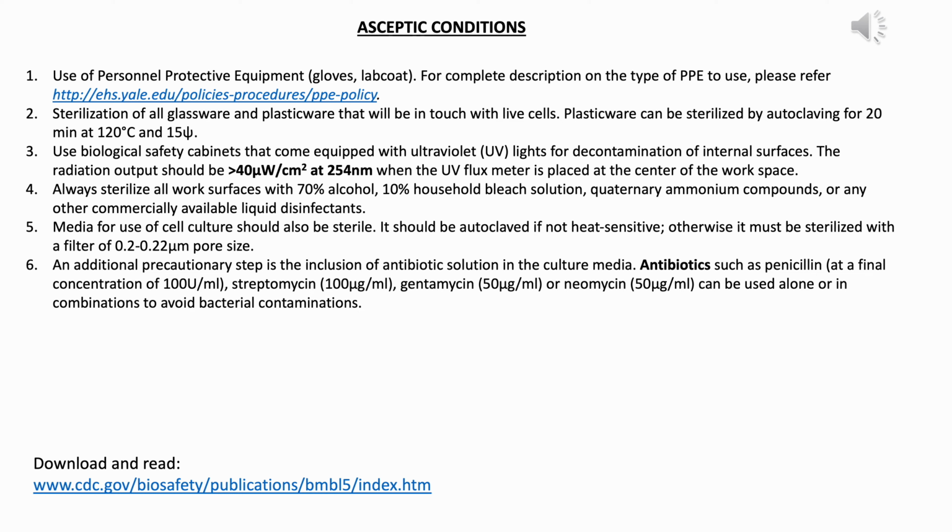For sterilization of all glassware and plasticware, we have already discussed autoclaving is essential, and autoclaving is done at 120 degrees centigrade for 20 minutes at a pressure of 15 psi. If you're using disposable ones, you don't need to autoclave them, but then you have to open them only inside the biosafety cabinet. The biosafety cabinet generally comes with a UV light for decontamination.